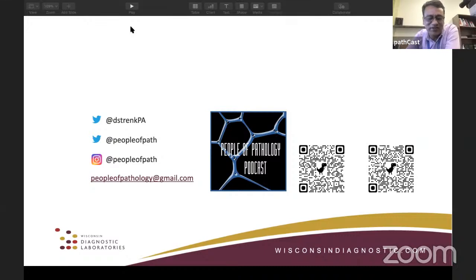As Mr. Frank has mentioned, we can put three sections in one cassette, and still it will represent 1 centimeter, one cassette per centimeter. But in sarcomas, we have to be really more careful, because it can be a heterogeneous tumor where more active areas may be misrepresented if we do not follow the 1 centimeter rule, isn't it? Right. And like I said, the 1 centimeter rule is a minimum, and you can often go over that. Sarcomas are a good example. We often do more sections than one section per centimeter.